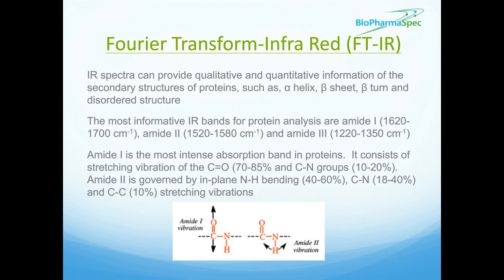Very similar to CD, but as I said, it's orthogonal, so it's not exactly the same, and it uses a different set of analytics to look at your method. So from a scientific viewpoint, using orthogonal methods is very good because you're using different aspects to probe the same sequence structure to see whether you're getting similarity or not.